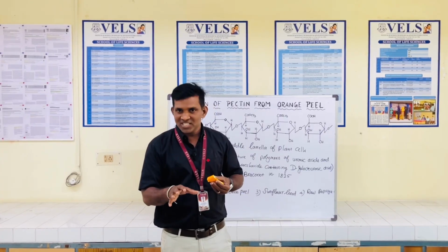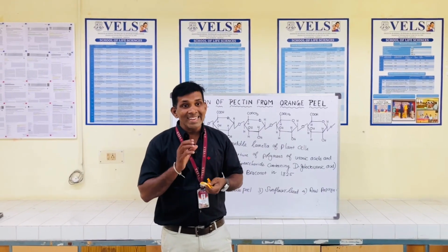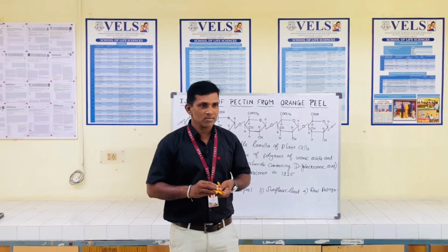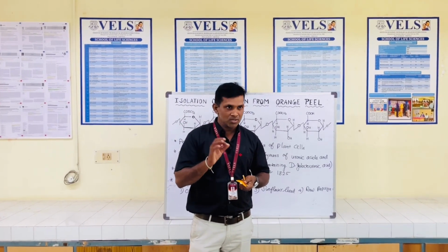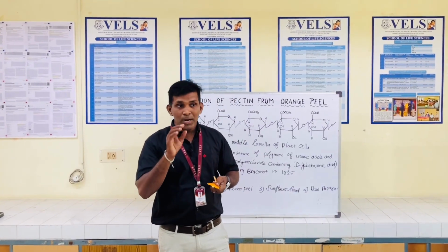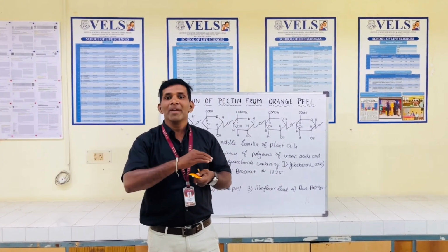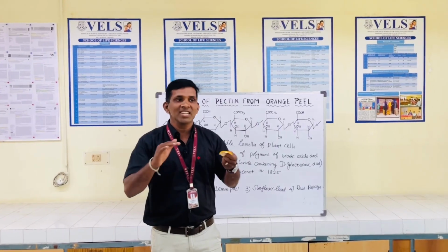Before heating the solution for 3 hours, add hydrochloric acid or citric acid to maintain an acidic pH.